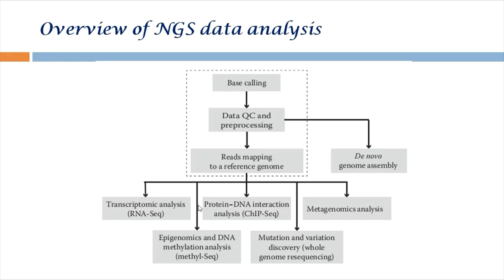So after getting the sequence, after getting the reads, there are several data analytic procedures that have to be followed, right? NGS has several kinds of applications. Whatever the application is, it has these three common steps: the base calling procedure, the quality control and pre-processing procedure, and the read mapping to a reference genome, that is the alignment to the reference genome.